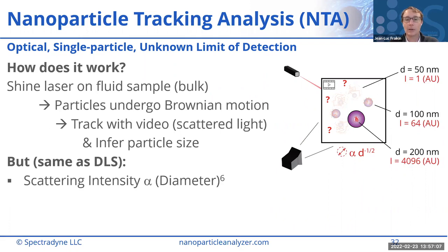And if you're concerned about variability from cartridge to cartridge, what you can do is spike in a known particle size and eliminate that completely, right? So if you spike in a polystyrene bead, for example, that is of a known size and concentration, you can normalize all your data to that, and you end up with a built-in positive control in every measurement that way to eliminate any kind of variability from different cartridges. Does that make sense?